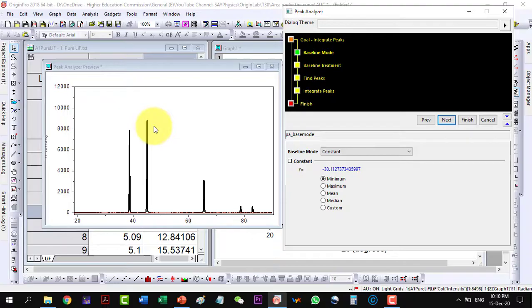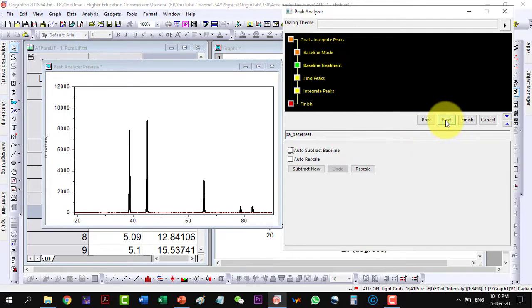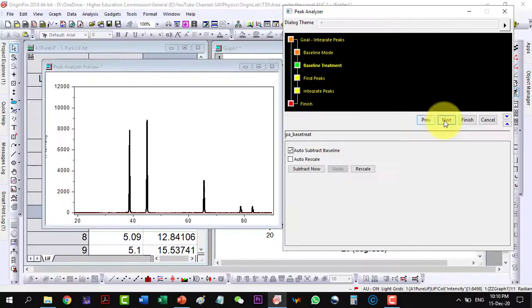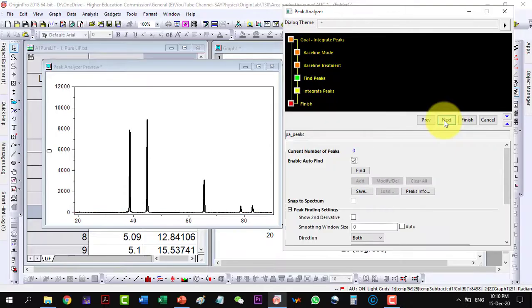This is already baseline corrected data, so I will not do any change here. And I will go to Next. And then I can click auto-subtract the baseline, because it is already having no effect on my data. And I will click Next.